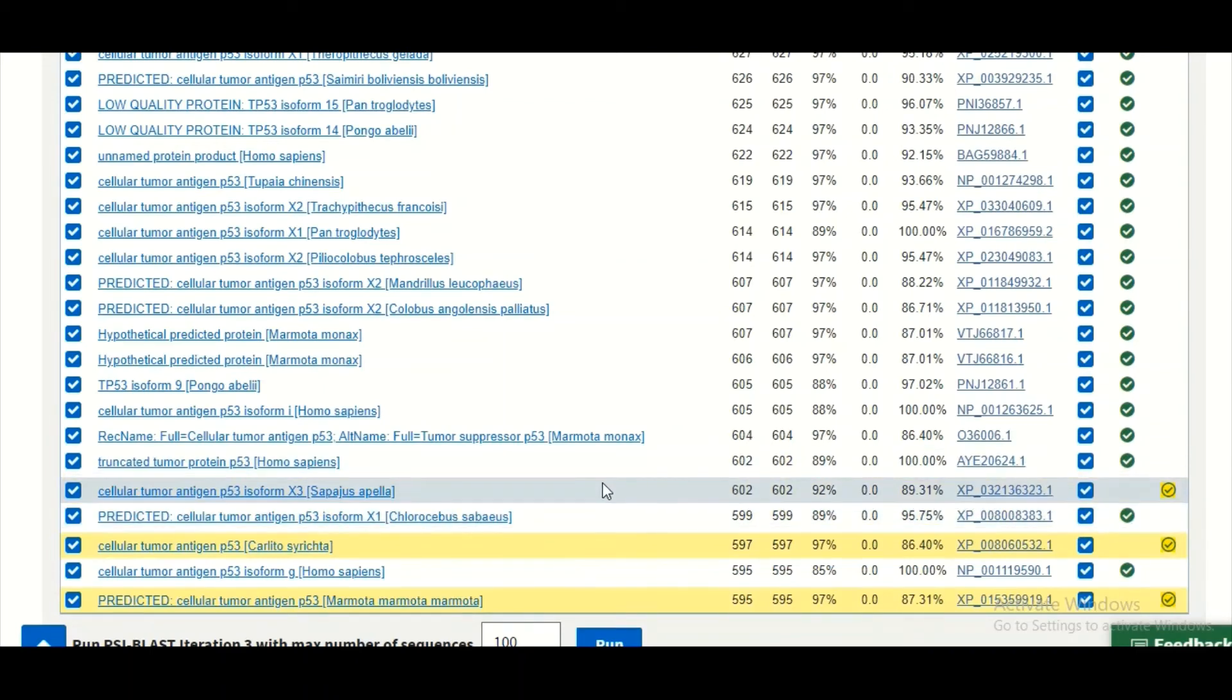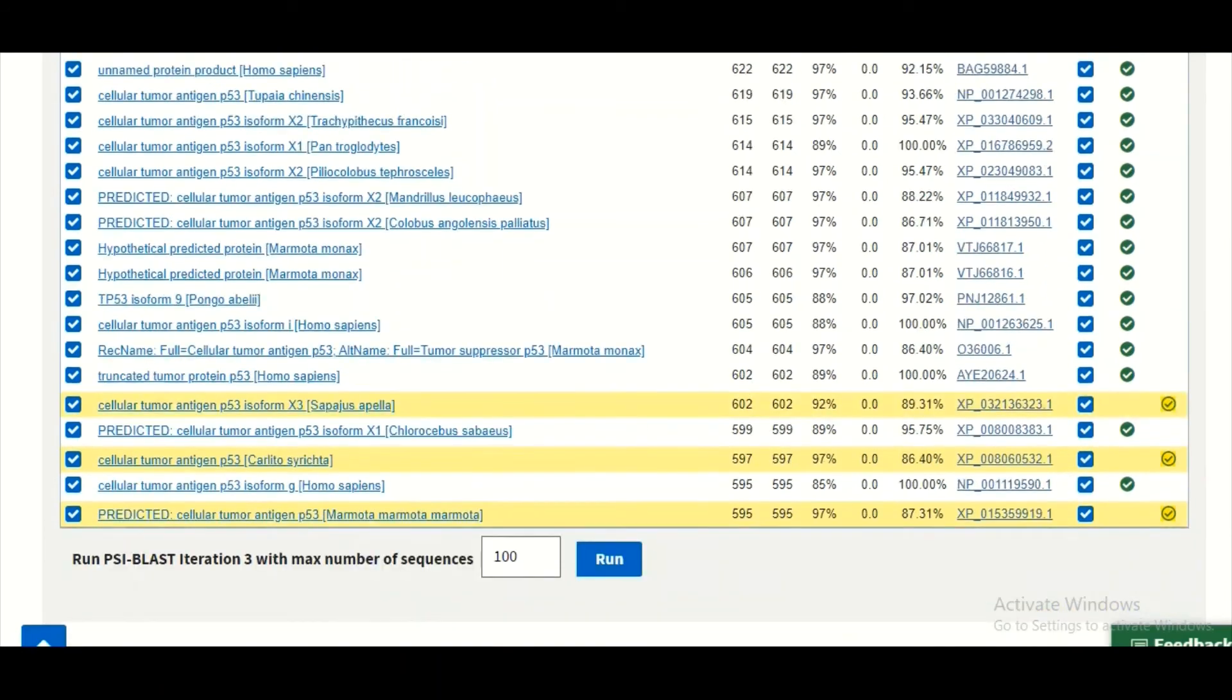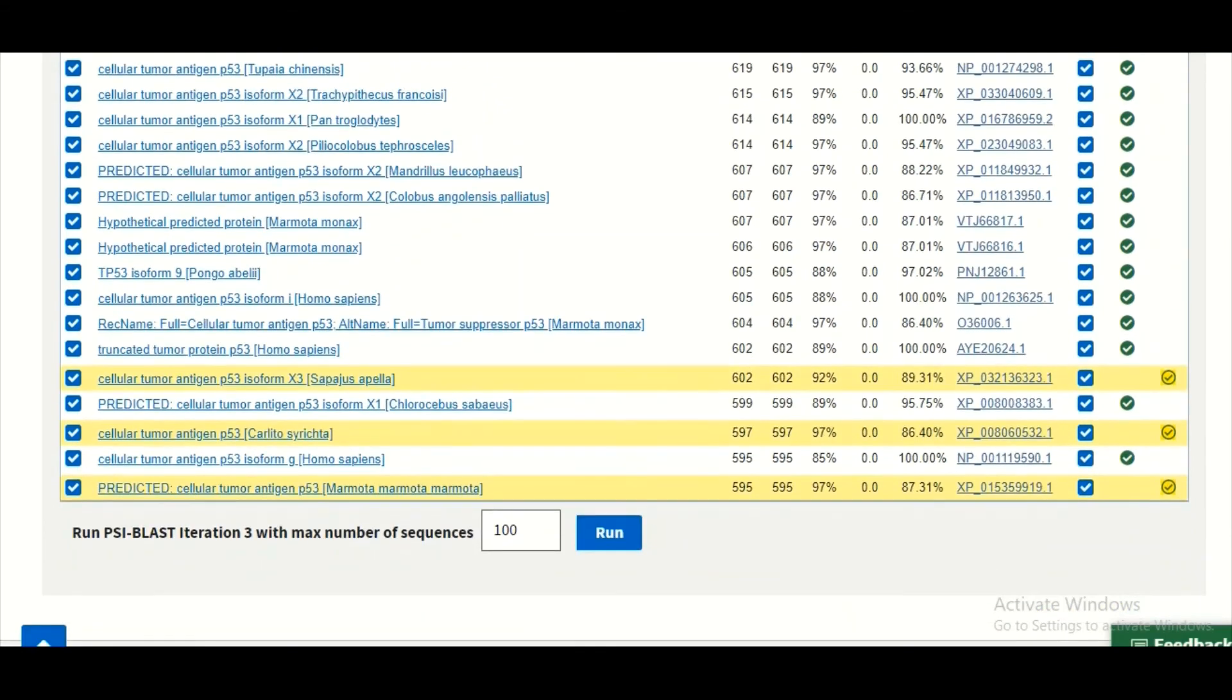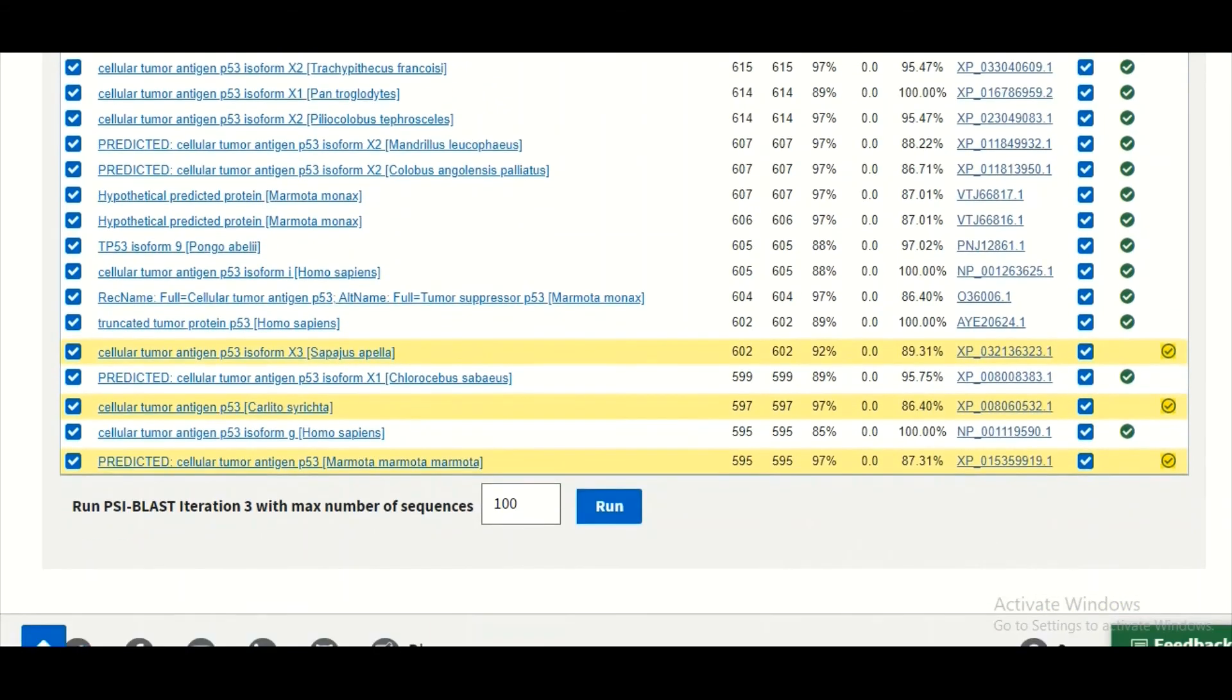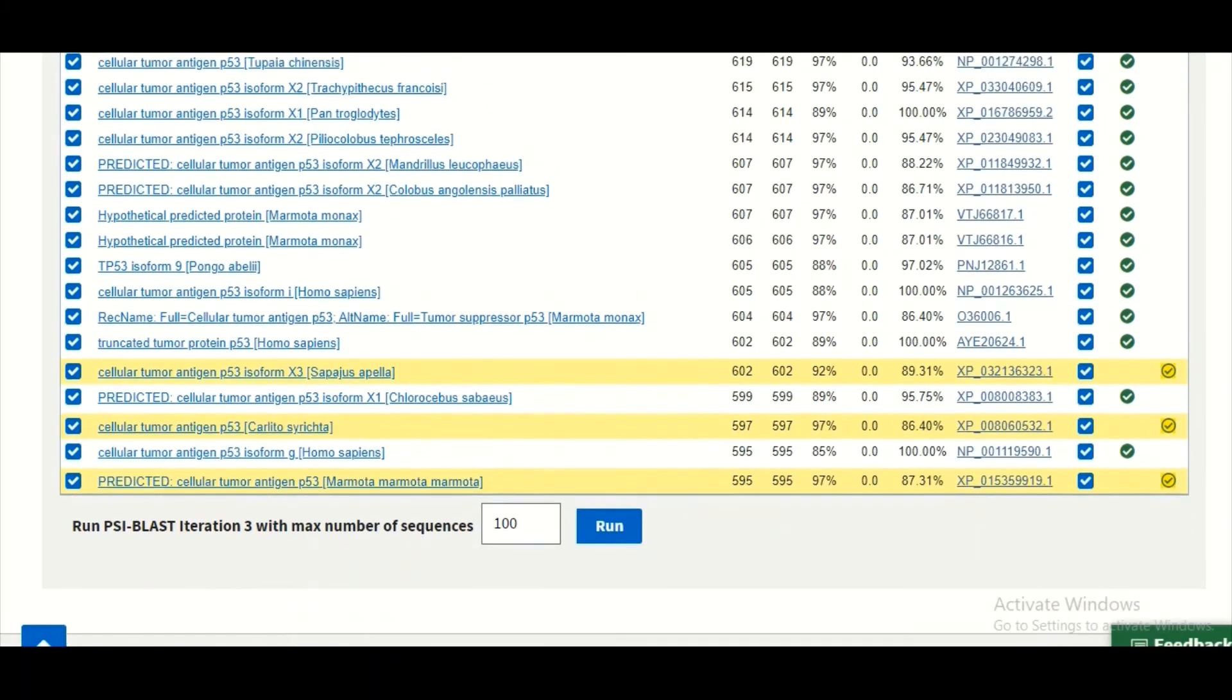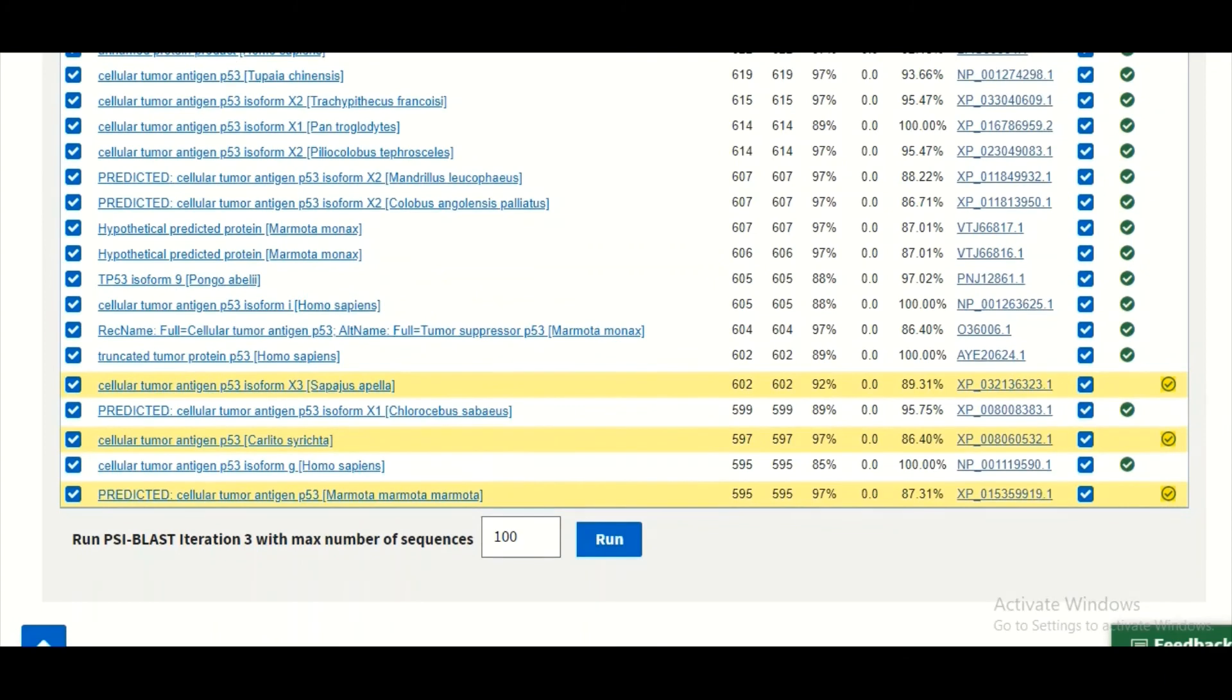Now you have to carefully see these sequences and you have to identify whether they are the true homologs of your query sequence or they are not the true homologs of your query sequence. If you still think that there are some other true positive values which are still present in the database and still they are not searched, you can click on this run button for a third round.